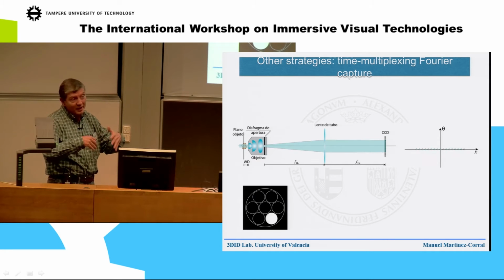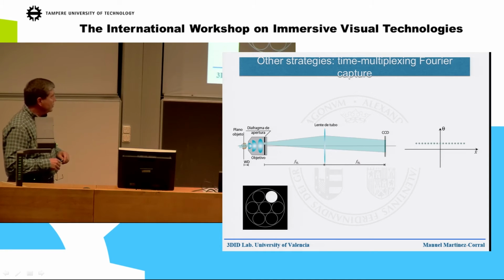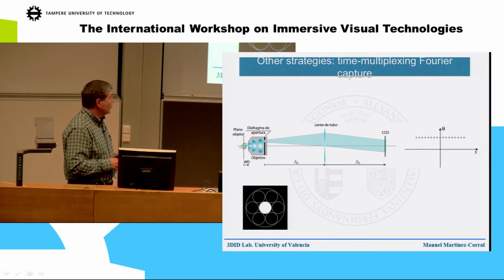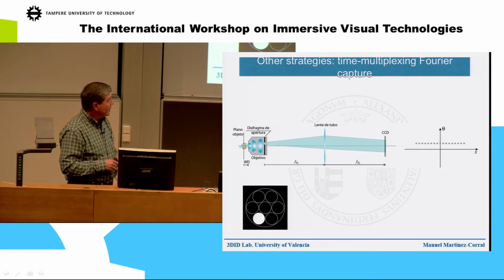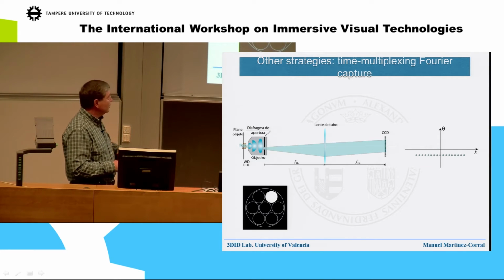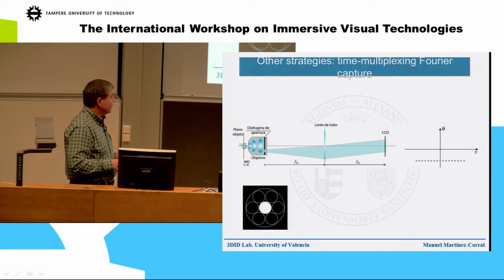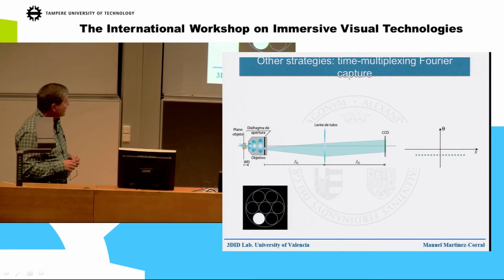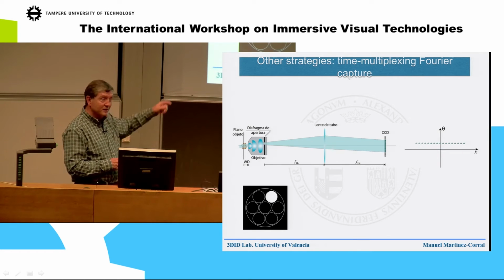Then the combination of them, I'm sure we still don't have results of this, but I think it will provide finally integral microscopy images with a good resolution, with capacity of generating views, and with capacity of making this depth rendering. So in fact, one of the ESRs that is coming to our lab will be developing this system.